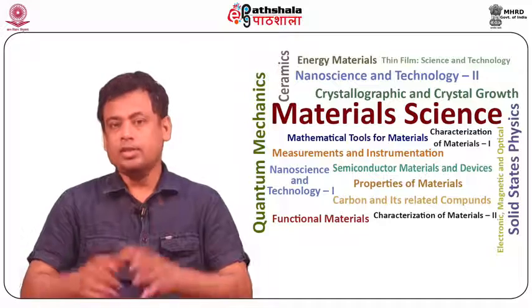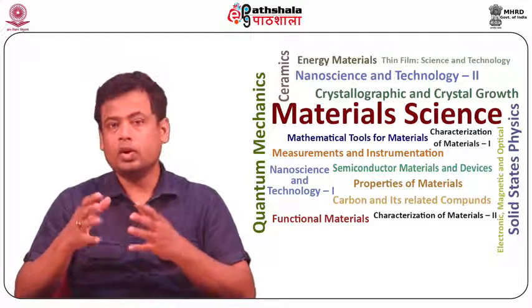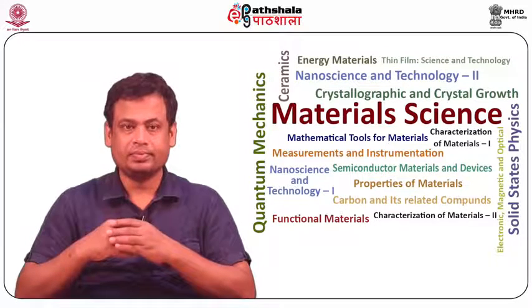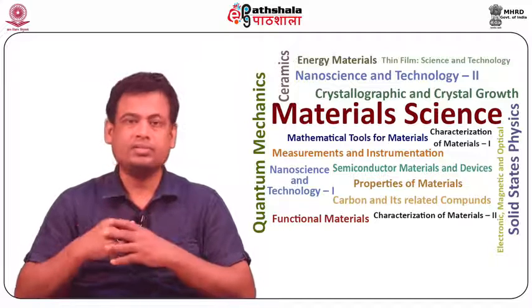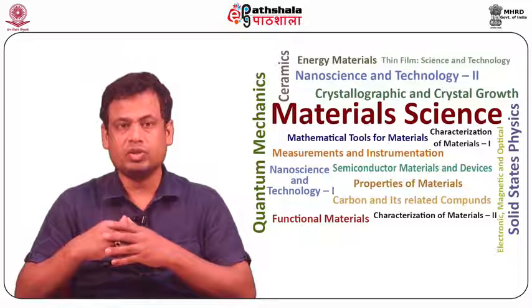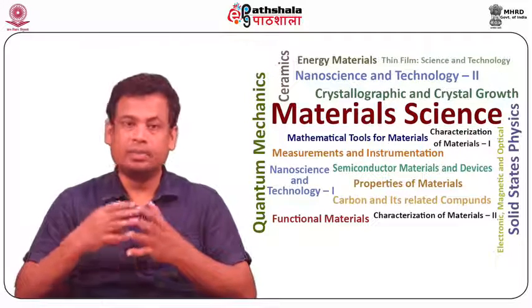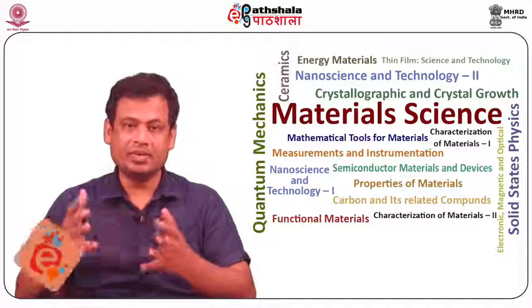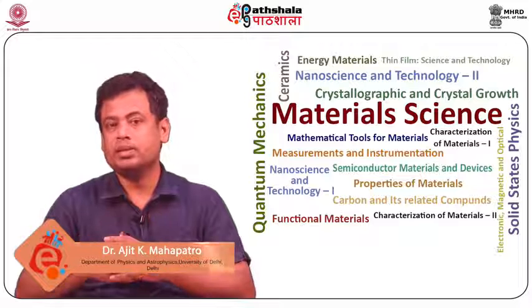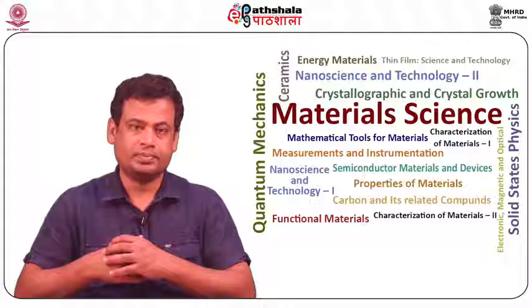So students, let us summarize what we have learned in this module. The introduction and qualitative analysis of XPS spectrum have been discussed. The peak identification, chemical shift in XPS spectrum and issues with insulating materials are discussed with schematic diagrams. The quantitative analysis of XPS and sensitivity calculation has been discussed, and the possibility of the depth profile in XPS samples is also studied. Thank you.